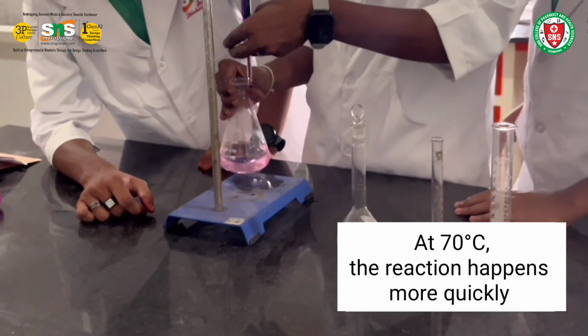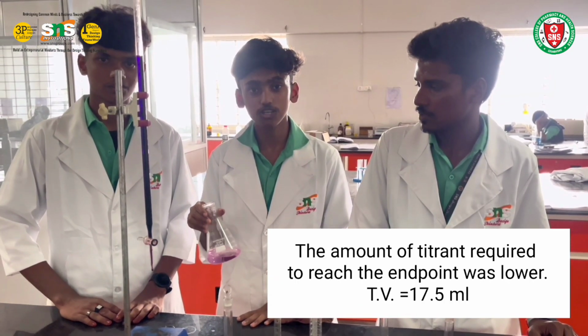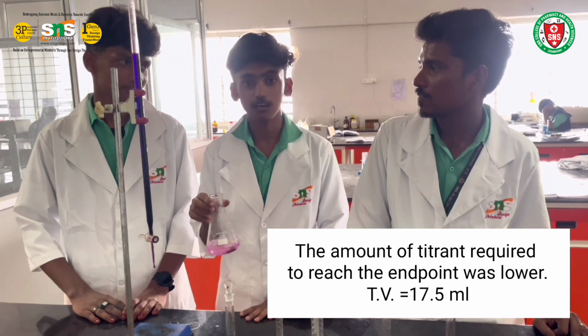After heating the solution at 70 degrees Celsius, the titrant value is 17.5.